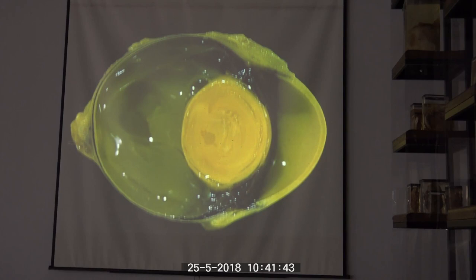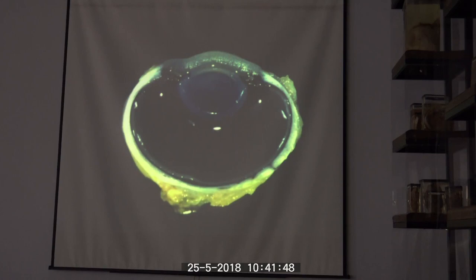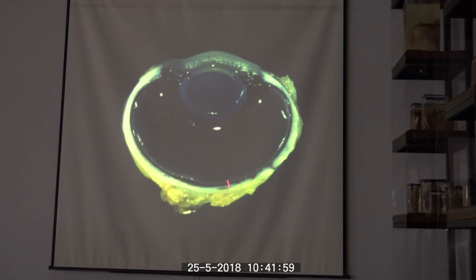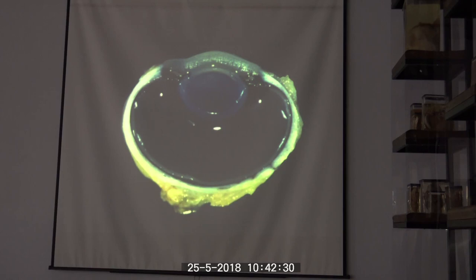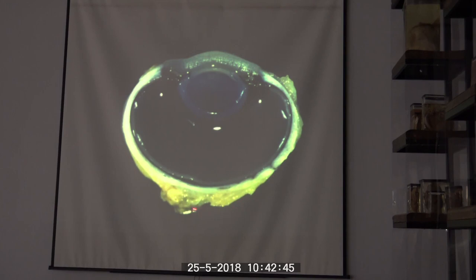Here we have a similar globe from a horse. In large animals it's especially important to remove as much extraocular tissue as possible because it's amazing how hard muscle gets after fixation. The greater the density difference between the hard lens, hard muscle, and softer tissues, the harder it is to obtain a nice histologic section. This is one more reason to remove all extraocular tissue to guarantee a better section.